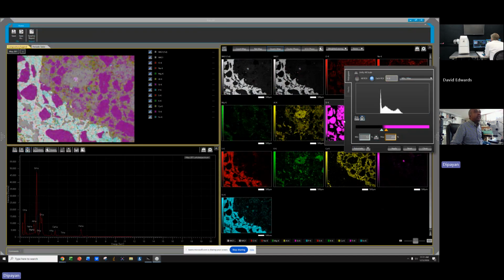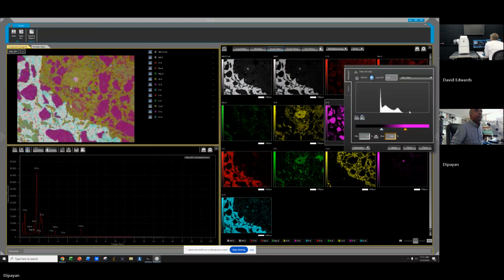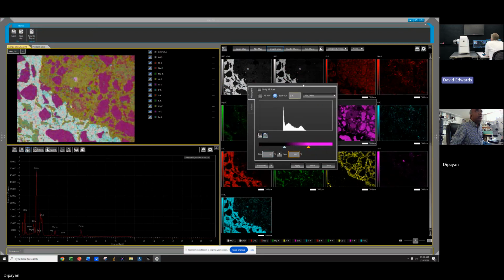If I don't do that, then it's all bright. So I still stay there. Yep. I usually bring the bottom arrow up a little bit. The white arrow there. Yeah, that one. So I take up some. So if you drag that whole box off to the side so we can actually see what we're doing.